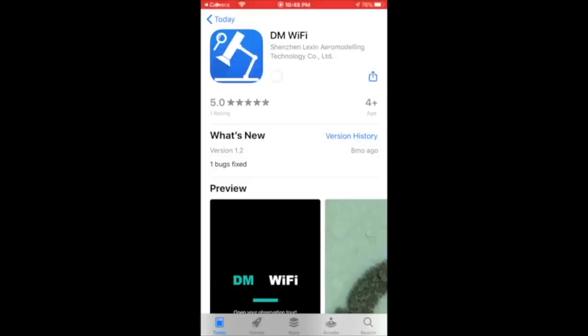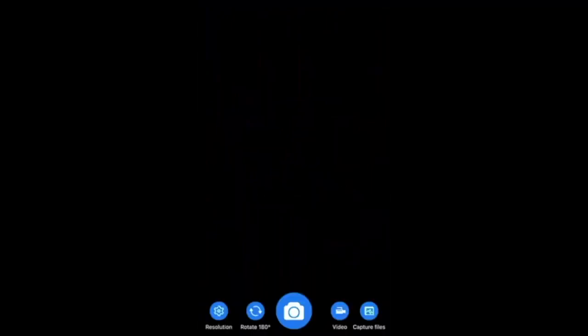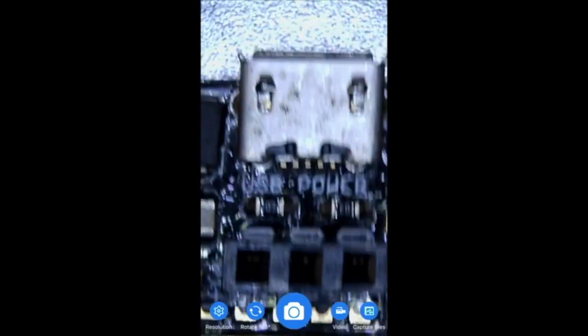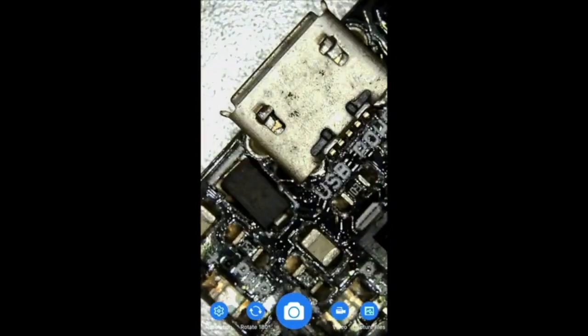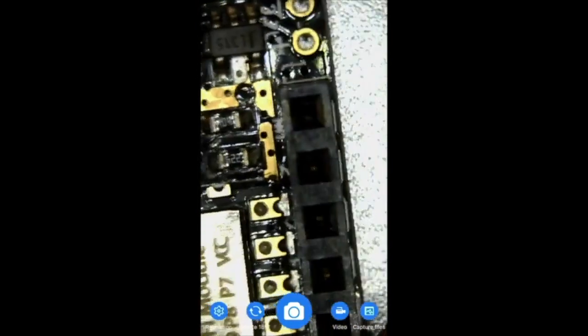Now let's take a look at the iPhone app. You can go to the App Store and search for DM Wi-Fi, or scan the QR code in the manual to link to the app store. After downloading, open the app and connect to the DM Wi-Fi network in your Wi-Fi settings. This is what it looks like in the iPhone app — you can move it around to see components with still pretty good image quality. If you aren't near a computer, you can use your phone to view images, take photos, save them to your photos library, and take video to save and view later.